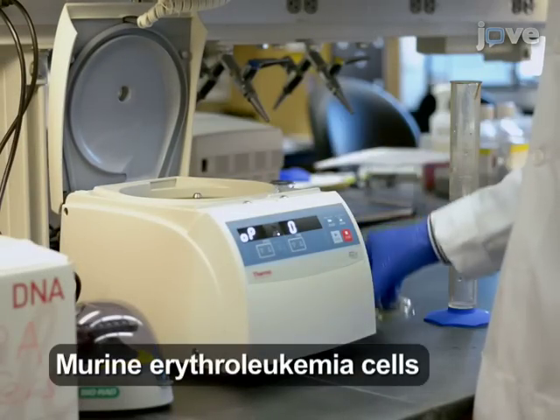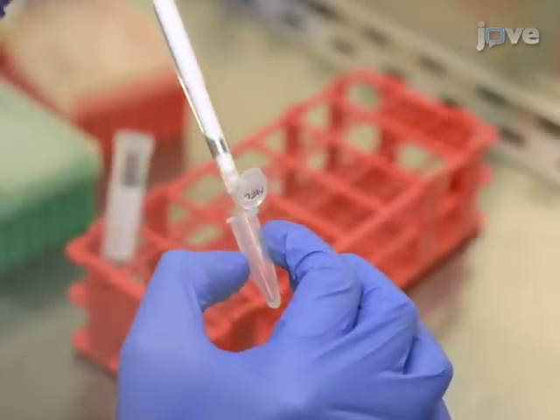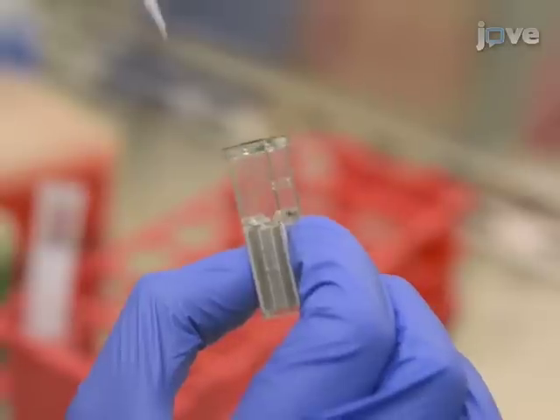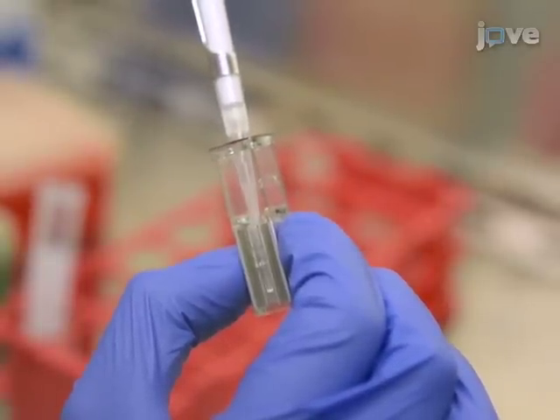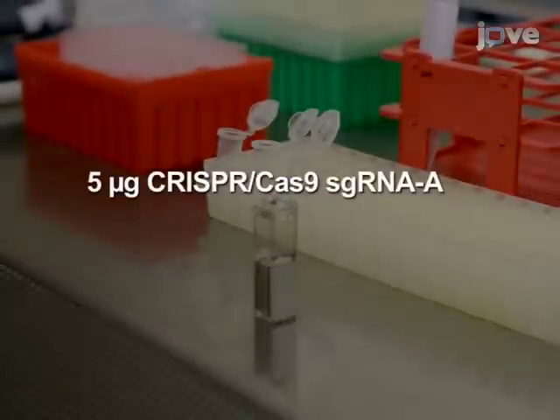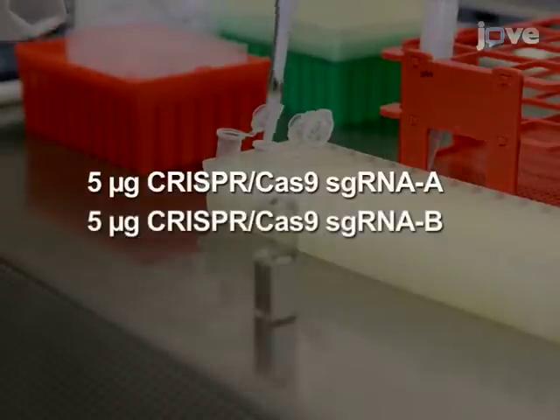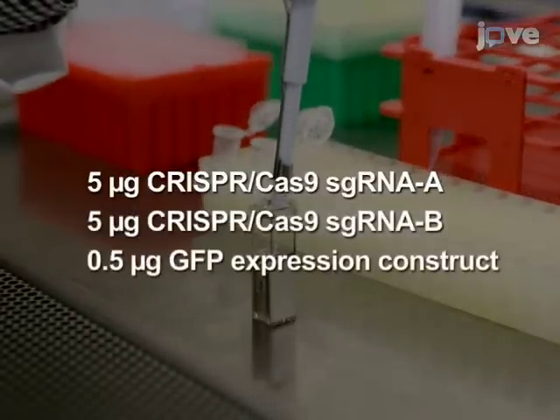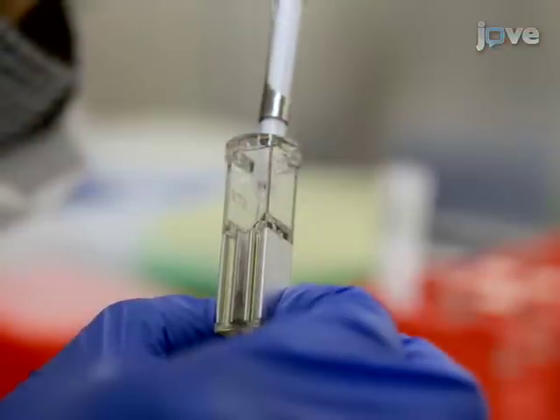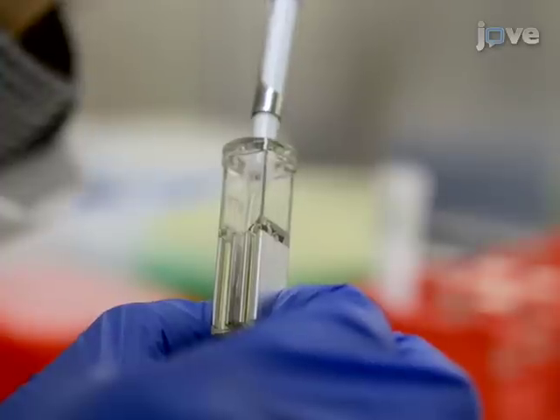For each CRISPR pair, pellet two times ten to the six cells grown in suspension. Resuspend the cells in 100 microliters of electroporation solution and then transfer to an electroporation cuvette. Add 5 micrograms of CRISPR-Cas9 construct sgRNA A, 5 micrograms of CRISPR-Cas9 construct sgRNA B, and 0.5 micrograms of the GFP expression construct. Pipette up and down several times gently to mix, taking care to avoid producing bubbles.